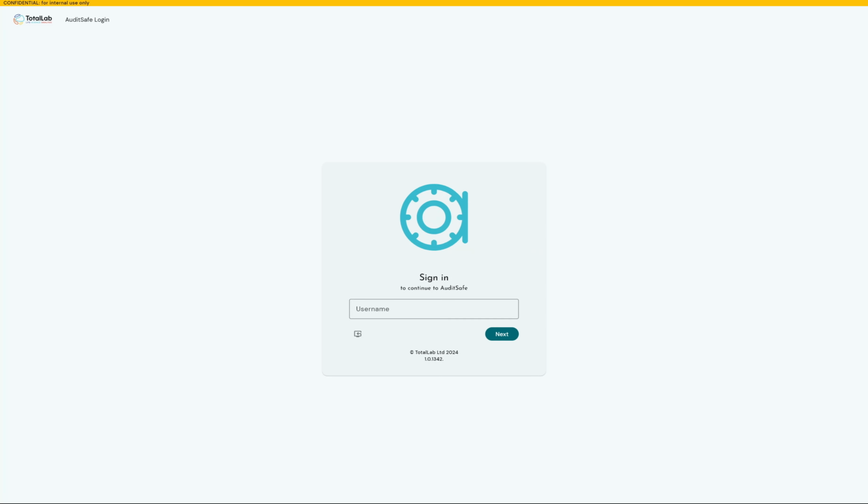I'll give you a quick run-through, a quick demo of what that looks like, what we can achieve with AuditSafe without having to compromise your on-site security by using VBA and enabling macros. If you've seen my other Microsoft Excel video using AuditSafe, you'll have seen this before, but I'll run through it nice and quickly, giving more of an educational lesson rather than a demo of the software. But I'll use the software to prove the points that I've got.